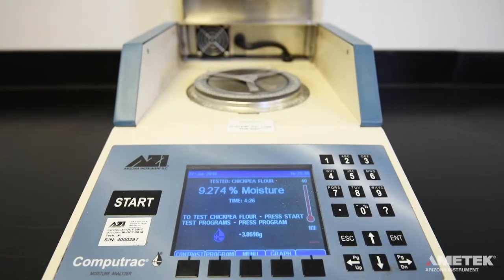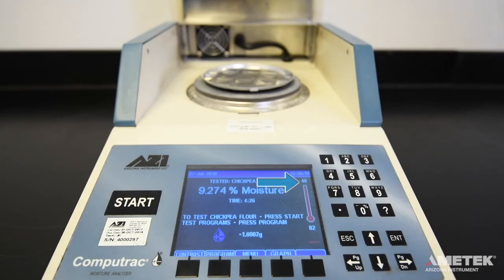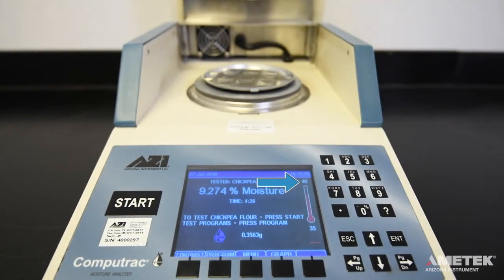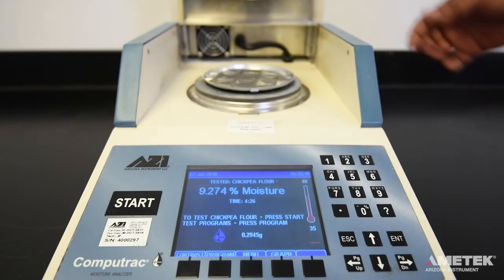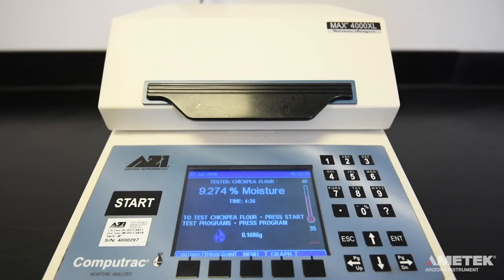Dispose of the sample as prescribed by the material manufacturer. Now, simply place a new clean pan on the pan support and wait until the chamber temperature is at least 5 degrees below the set idle temperature before closing the lid. When you close the lid, you'll notice that the real-time temperature is still too low to start the test. You need to wait until the instrument is within 2 degrees of the target temperature. Once the instrument is ready to begin the next test, simply follow the same process as before.